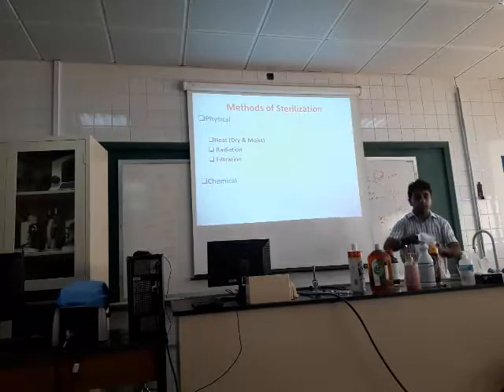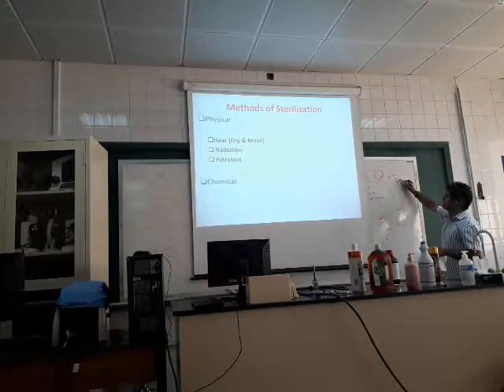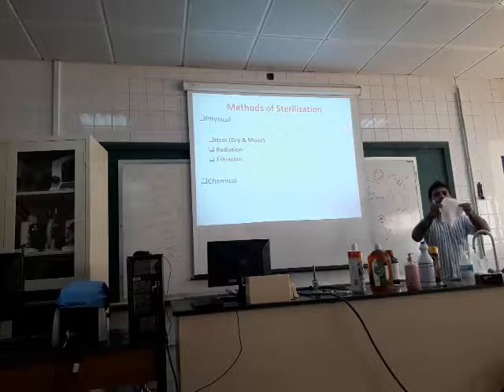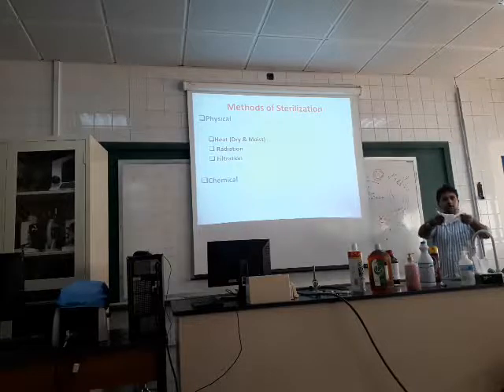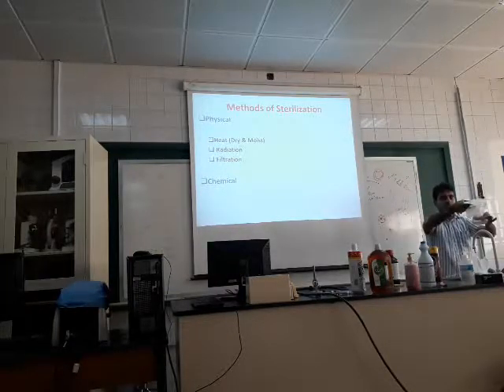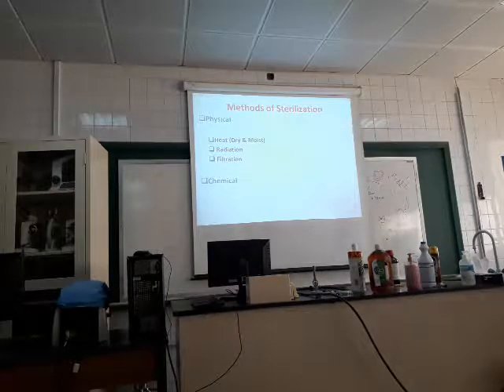So what is the purpose of this filter paper? Its pore size is 0.45. It stops bacteria, virus, spores and fungi. They will not cross this pore, because the size of the pore is so small. All of them stay on the top, and at the bottom you get a clear fluid. This is the reason it's called filtration: you are filtering something. After filtering, you remove the paper like this, keep the result here and throw the paper out. This is the filtration.